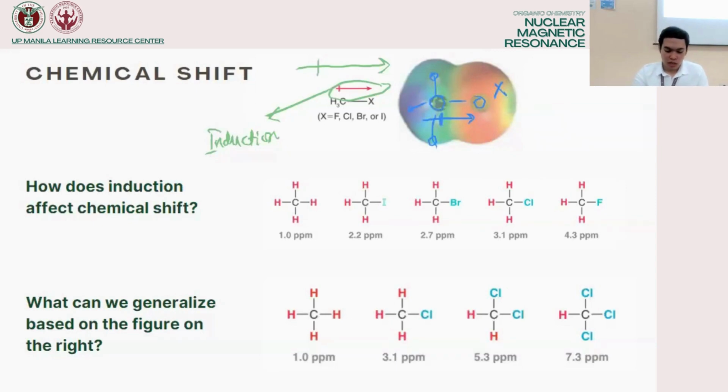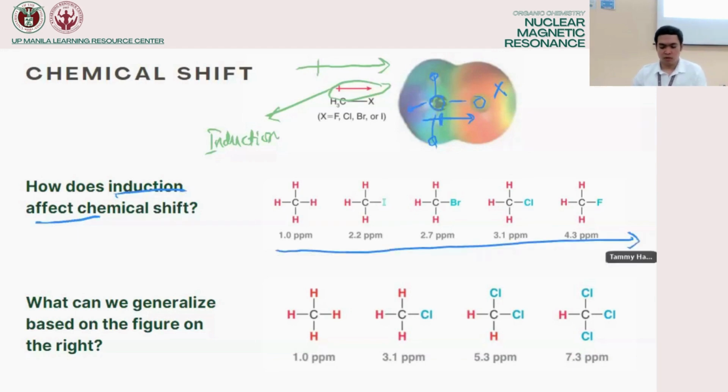As you can see here, what's the trend? How does induction affect chemical shift? I only just saw the chat. How does induction affect chemical shift? Electronegativity, correct.